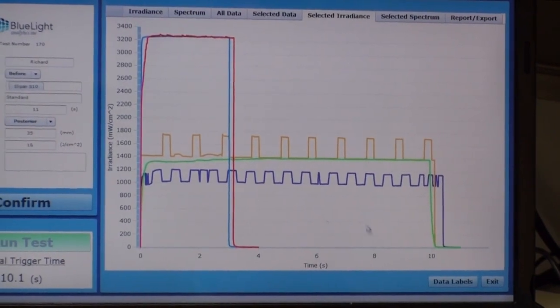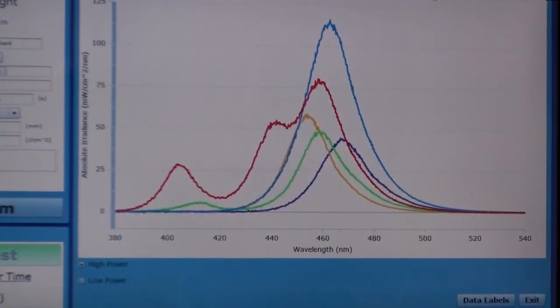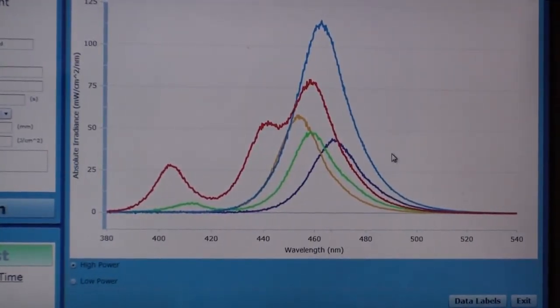It's interesting to look at the spectrum as well. We can see here the spectrum is different. So when we hover over the line, we can see the information we selected to be displayed.